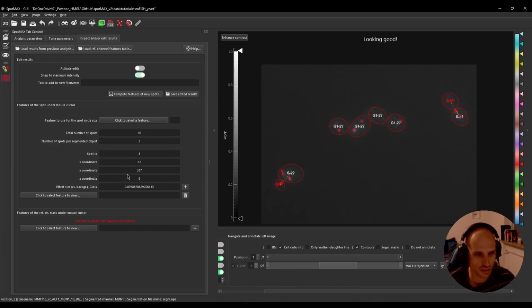I know this sounds a little bit hand wavy, but trust me, it's actually very good and recommended to spend some time visualizing your data, how it looks, and so forth. Because even if you were to go with a machine learning method, before machine learning there is always a step of data exploration where you spend as much time as possible with your data, trying to understand patterns and see if you can spot stuff, because any algorithm would not be smarter than you spending some time with your data anyway.